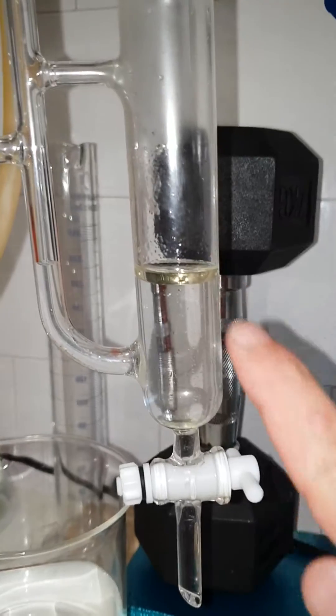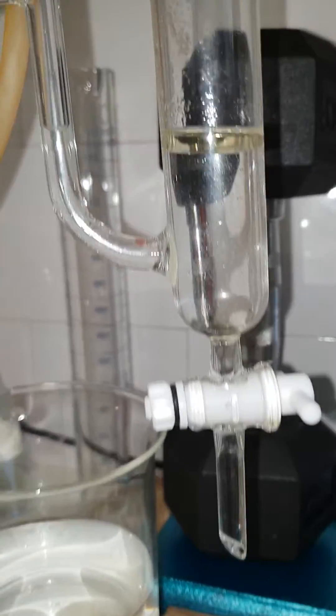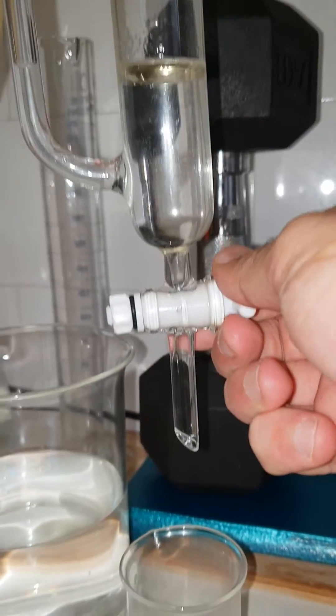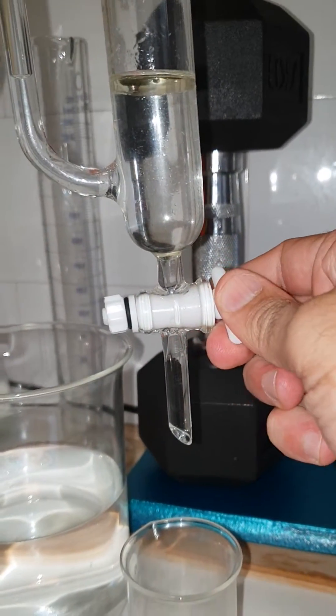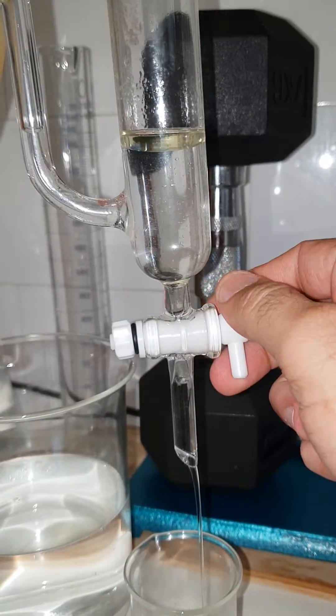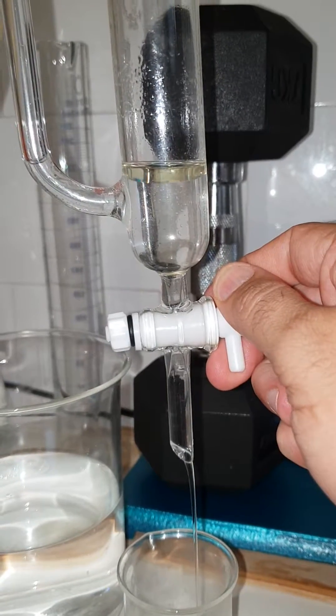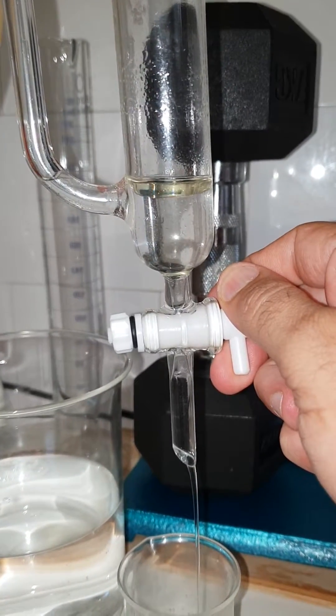As you can see, the oil sits on top and there's water underneath. I'm opening these to drain out the water, then we'll get to the edge, close it, and make sure to collect it all.